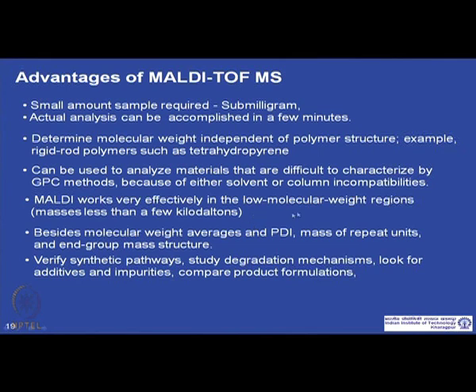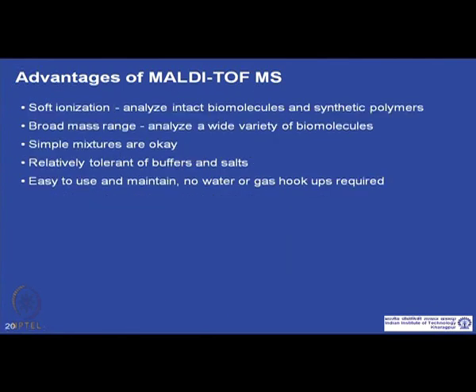and MALDI works very efficiently for low molecular weight regions where GPC does not work, and besides molecular weight averages and the polydispersity index, the repeat unit mass and end group mass can also be obtained. So, these are all the benefits, but the only disadvantage is that the price of MALDI-TOF is very high. So, it is not very convenient to use MALDI-TOF in every lab.